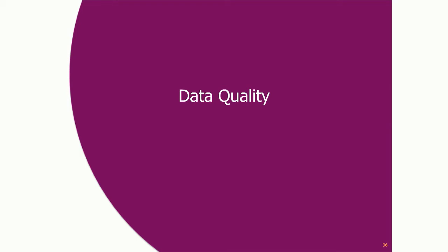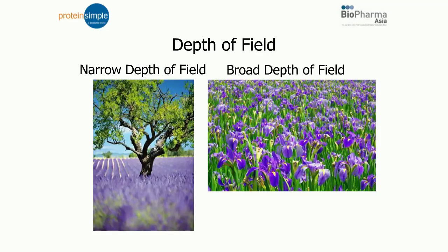And finally, I'd really like to talk about data quality. This is another very important attribute of MFI. And so in MFI, as in any optical technology or microscopic technology, depth of field is a very important consideration when taking measurements. And I'd like to use these two pictures of flowers to illustrate this concept.